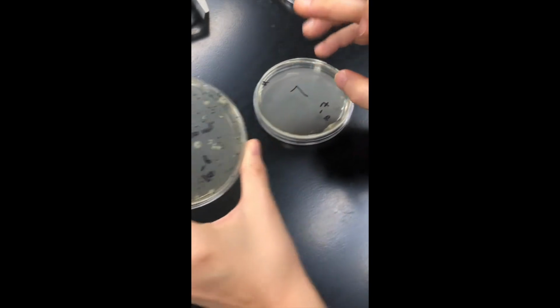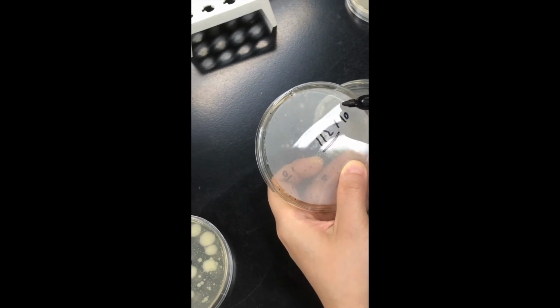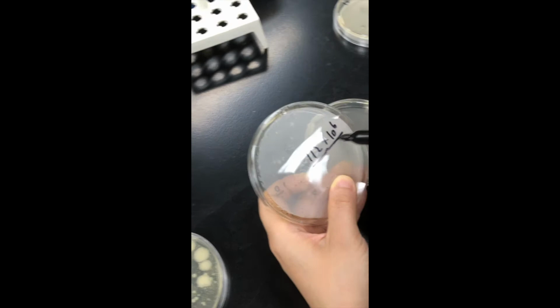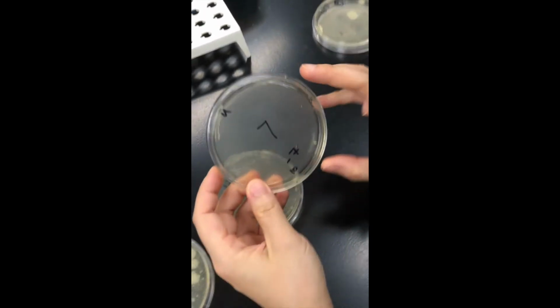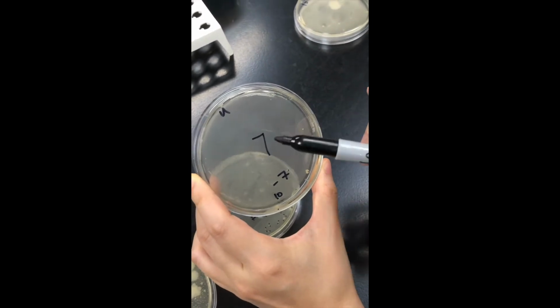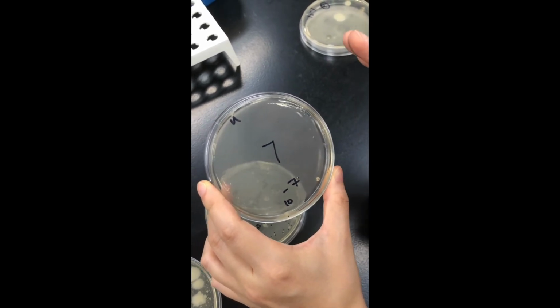So you know how to get the CFU per ml for this plate. This is by multiplying this number by 10 to the 6. This is our dilution factor, and then we'll get the CFU per ml concentration of our 10 to the minus 6 plate. And we have a 10 to the minus 7 plate. I can't finish the counting. All the cells, there are only 7 colony forming units present here.